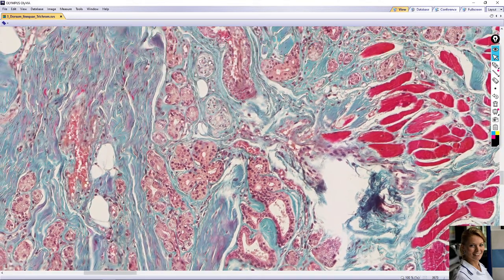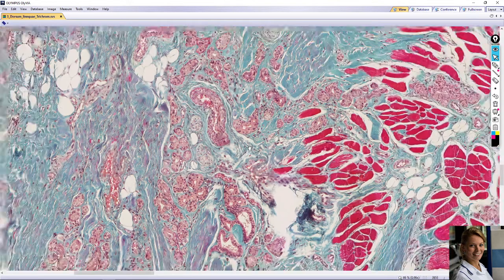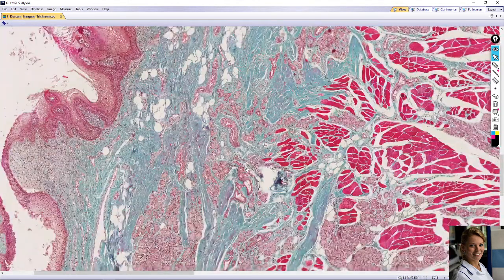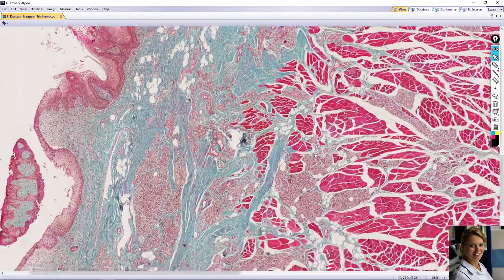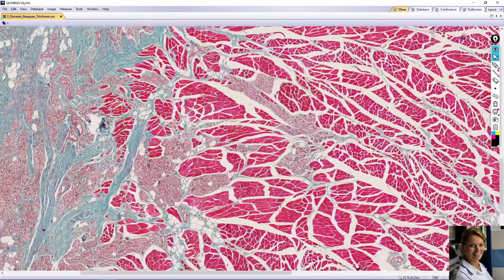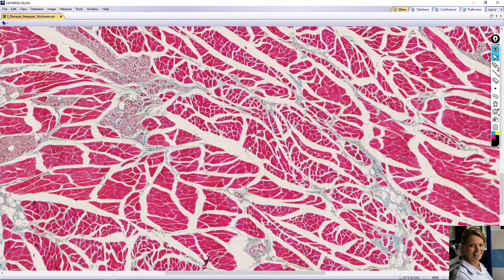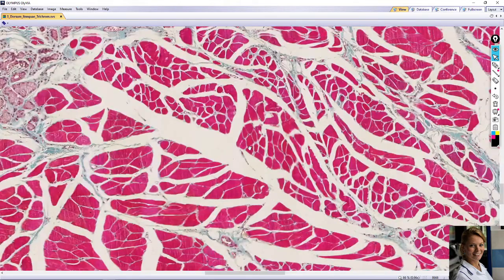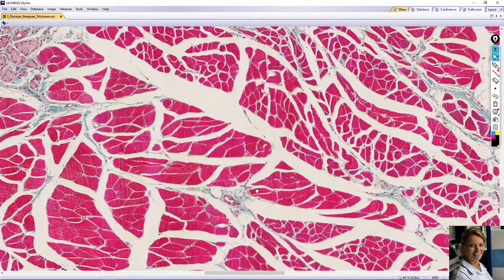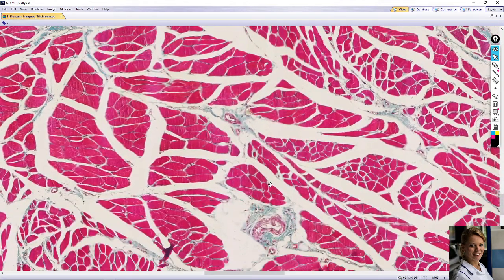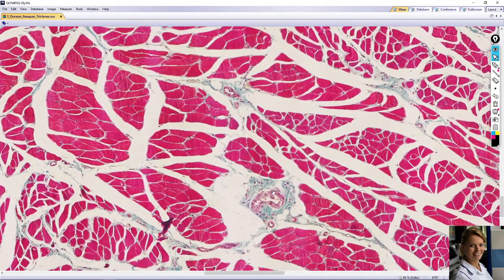Here are nerve fibers. Most of the core of the tongue consists of interlacing bundles of skeletal muscle fibers. This interlacing arrangement of the skeletal muscles gives the tongue the necessary mobility for phonating, chewing, and swallowing of food.